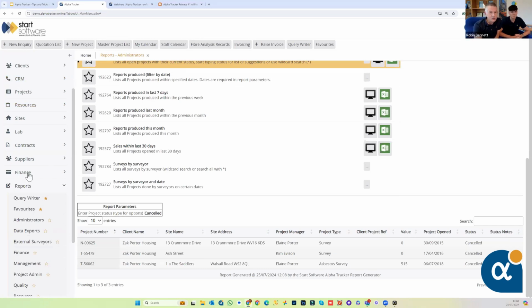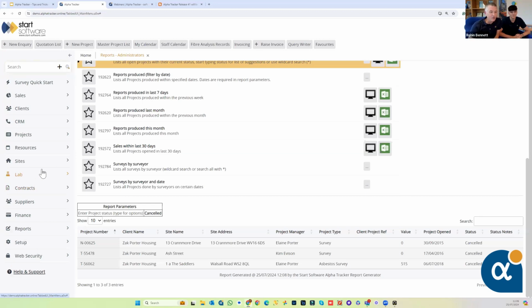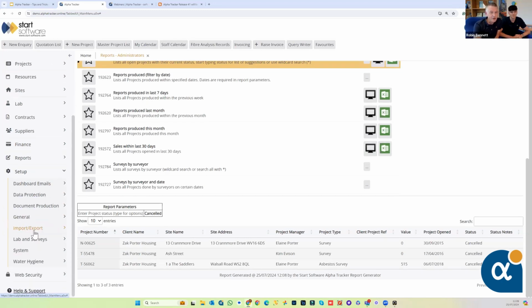Now, the last thing we want to talk about on here, which is something that Kim was really keen to show you, if you're a super user at your site, so a super user within Alpha Tracker for your own business, like I am here on the demo system, you can actually see how the reports are put together.